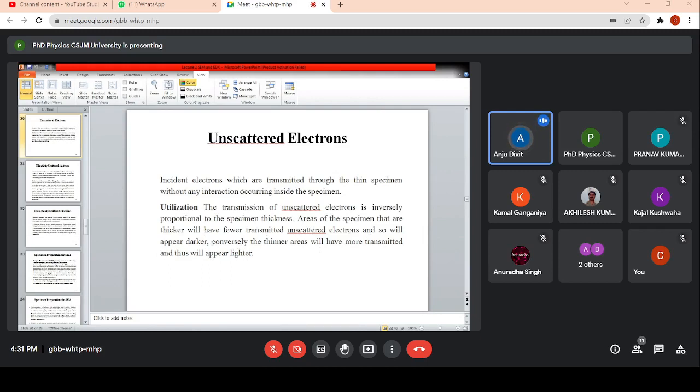So इसके इमेज से आप ये भी डिटेक्ट कर सकते हैं कि इसमें अनस्कैटर्ड इलेक्ट्रॉन्स प्रेजेंट है कि नहीं है. तो ये भी यहाँ पे आप इसकी इमेज से डिटेक्ट हो सकता है. जो इलेक्ट्रॉन्स आपके डायरेक्ट पास हो रहे हैं, डायरेक्ट ट्रांसमिट हो रहे हैं, उस पर आप इसकी भी इंफॉर्मेशन यहाँ पे मिल सकती है.